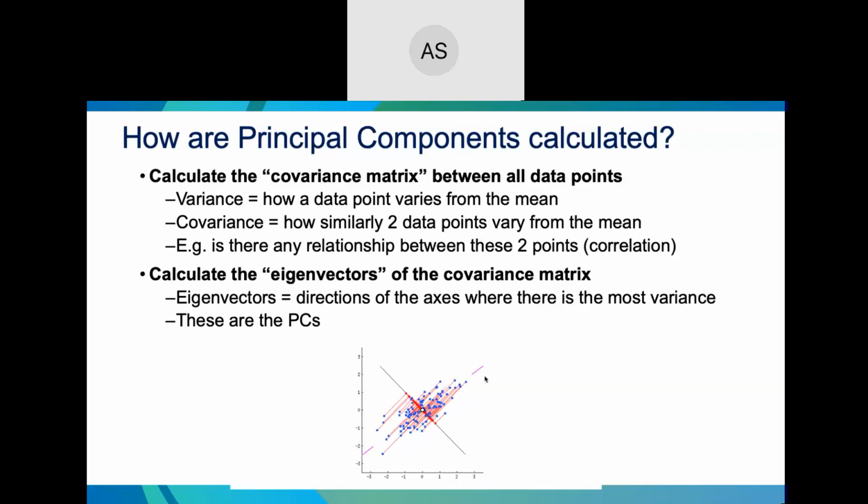So the second principal component is this thinner line that you can see spinning here perpendicular to the longer first principal component line. And so we want to stop that line along the opposite axis. So that's how you get the first two principal components.